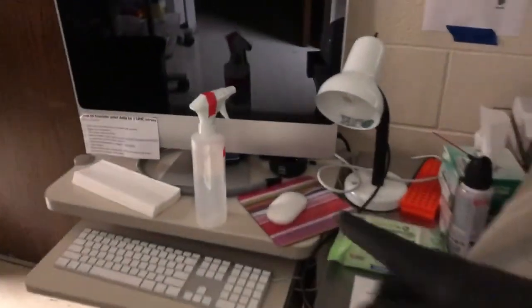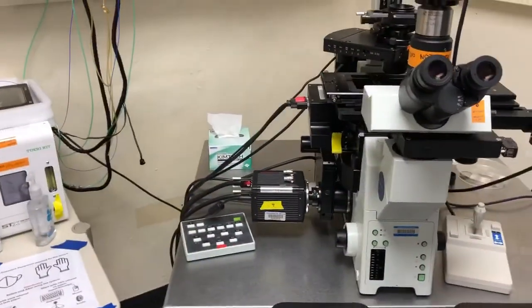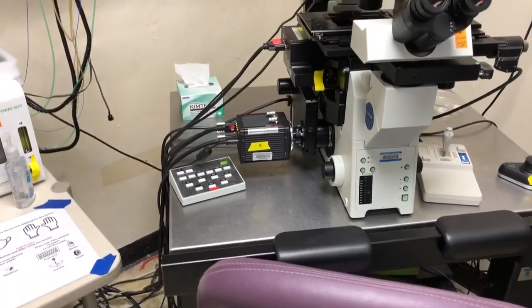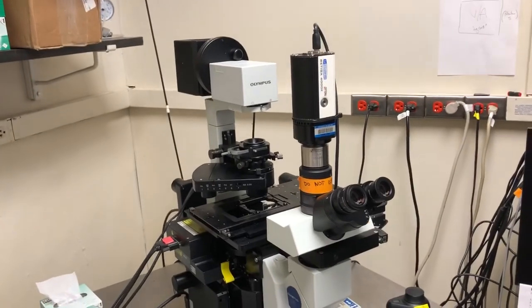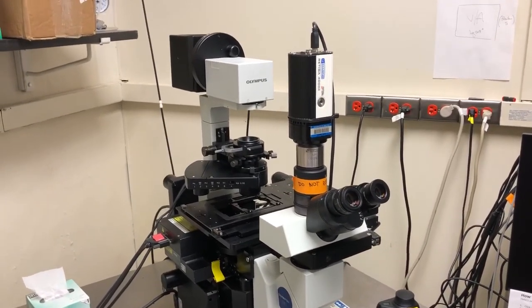70% ethanol, if it's not on this table, you'll find it in this room over here. The microscope has been disinfected, so let's go on to the startup procedures for this microscope when we are doing bright field illumination.